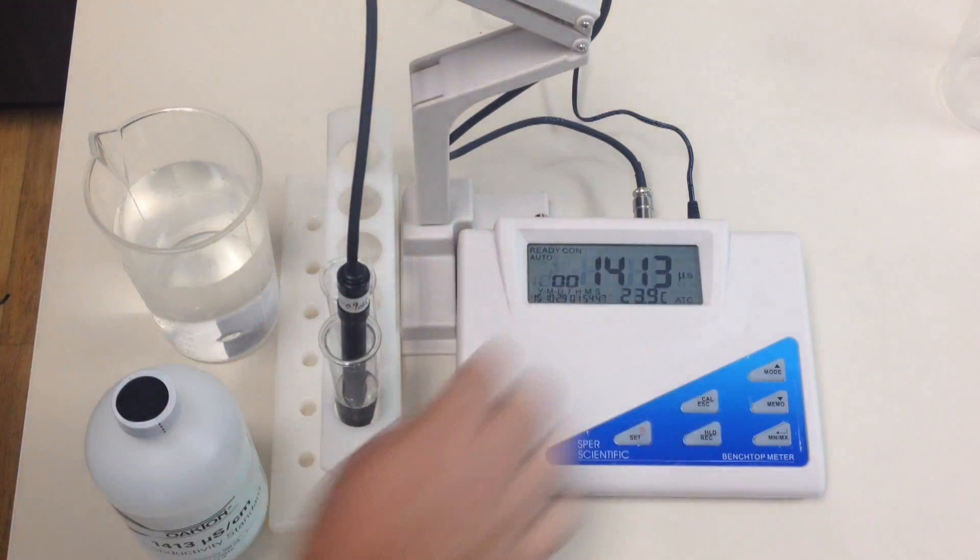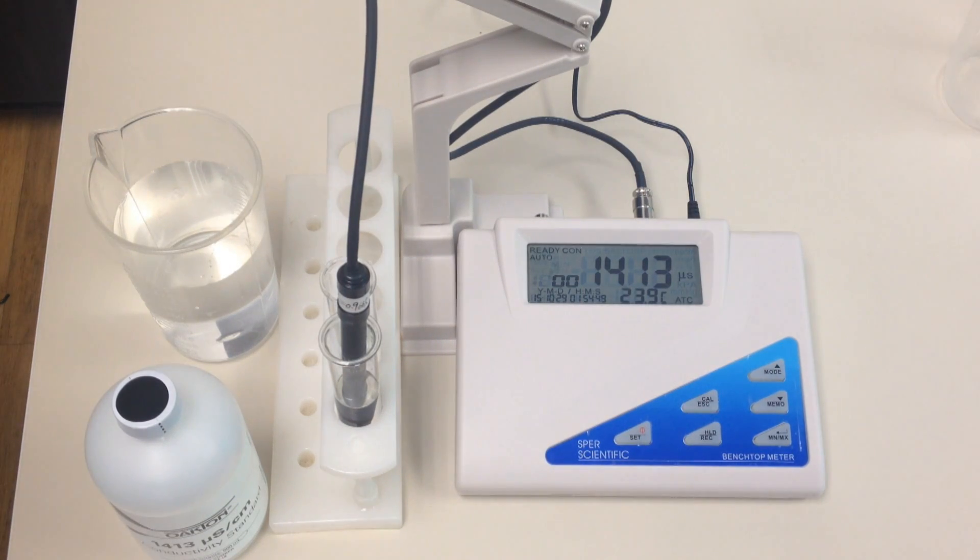Let's say you got an error message, such as error 17 is an example. For any of the benchtops, any time you get an error message, you need to reset them back to the factory settings. This information is found on page 56 of your manual, and it works the same for any of the meters.